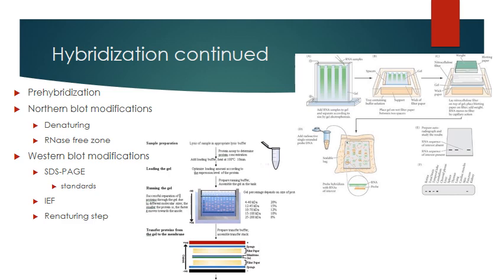And again, you're going to use the same thing. You can use a capillary transfer to the nitrocellulose or electrophoretic, whatever transfer mechanism you want. And this cartoon gives you the steps that go through. You can read through those to be sure that you understand them as you go through the separation of those molecules.